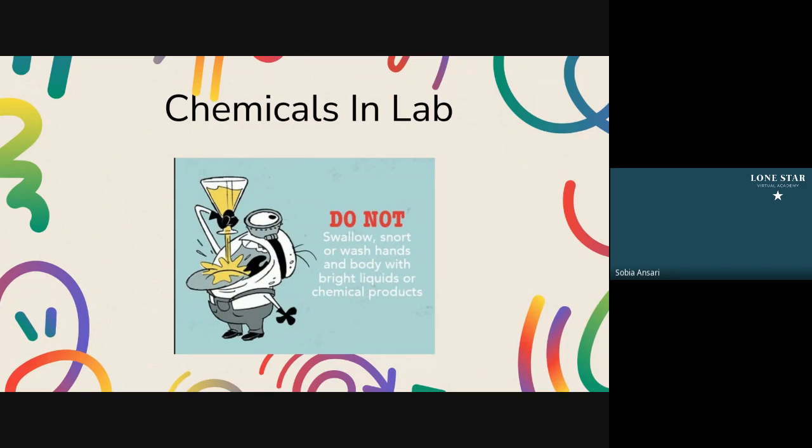When you are smelling the chemicals, you have to waft, which means you wave your hand in front of the chemicals and let the smell come to you. Some of these chemicals can irritate your nasal passage or your throat. So that's why you always want to waft when you're smelling the chemicals.